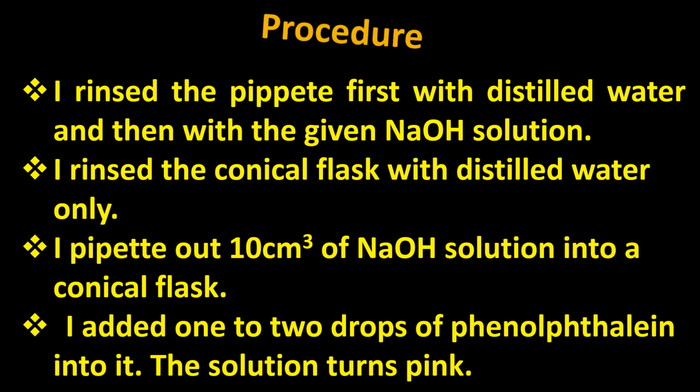After the chemicals and the material required, the very important thing you have to write in your exam sheets is the procedure. For the procedure, the first thing is that you have to wash each and every apparatus. And you have to write the procedure in such a way that it's all done by you, not like you have seen in the practical copies. You have to mention that I have done this.